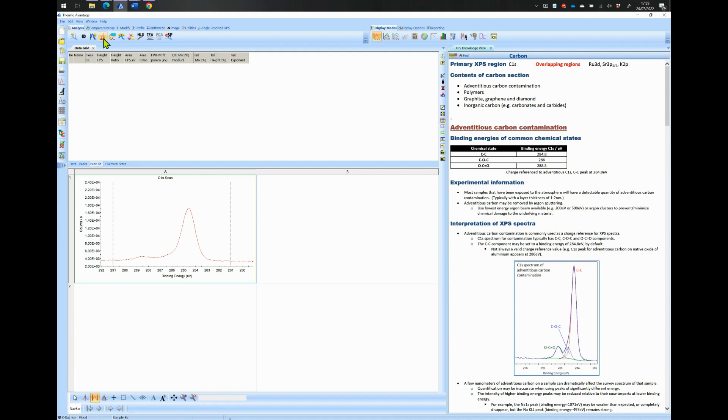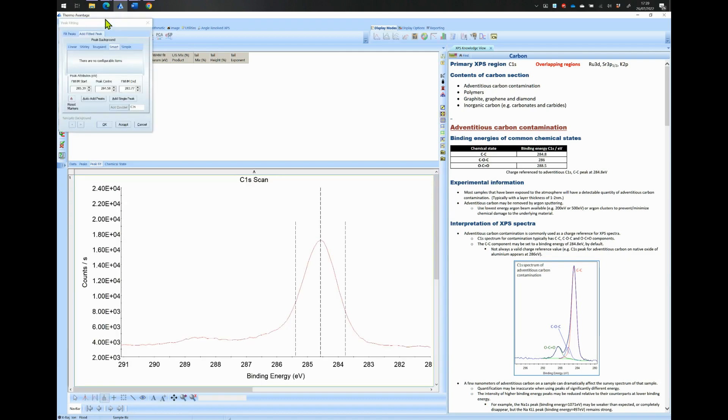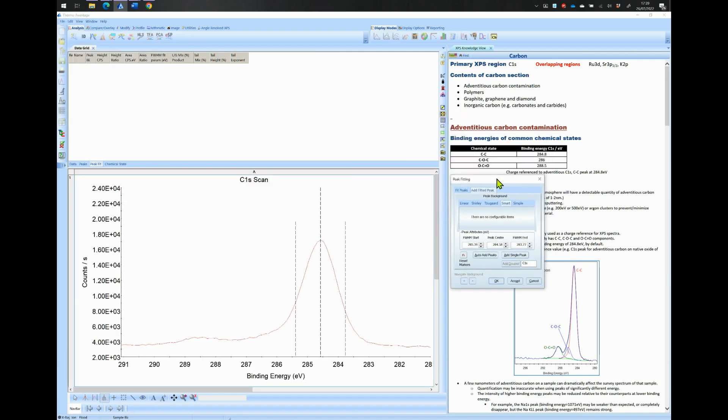Next, click on the icon called Peak Fitting which is located in the Analysis tab as shown here. Place the Peak Fitting window on the side so that it does not obstruct with the fitting view. Select the Peak Fit Table tab to see the properties for each peak.